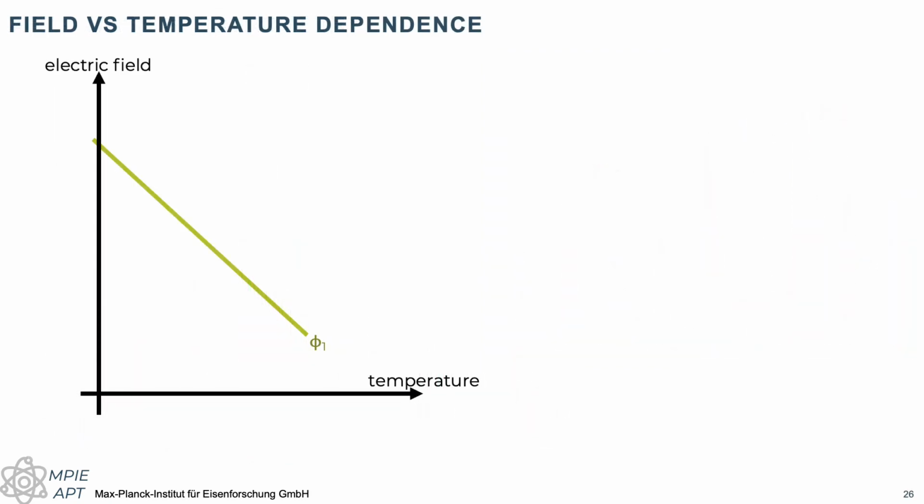So if I go back to some more theoretical considerations that actually have a practical influence, I have told you that the field evaporation was a thermally assisted process, and the barrier that you need to overcome to remove the atoms is dependent on the field. So if I consider a certain rate at which the ions are being detected, then at a low temperature I need a high field, and at a higher temperature I will need a lower field.